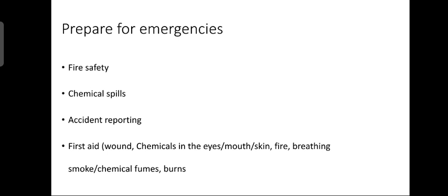Wash your hands thoroughly before treating casualty suffering from a cut or wound, a burn or any eye injury. In all cases of skin, eye or mouth contact with an injurious chemical substance, thorough irrigation by rinsing with water should be the first treatment. Cuts or scratches, however small, should receive immediate attention. The wound should be covered as soon as possible with a sterilized wound dressing.